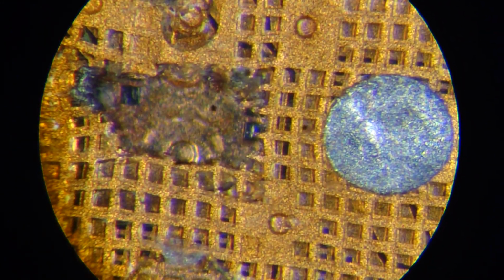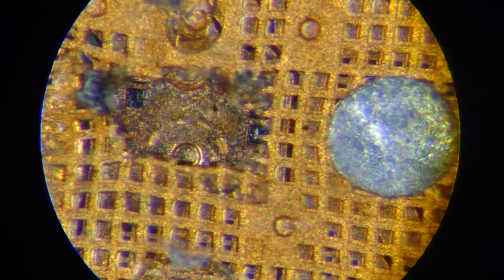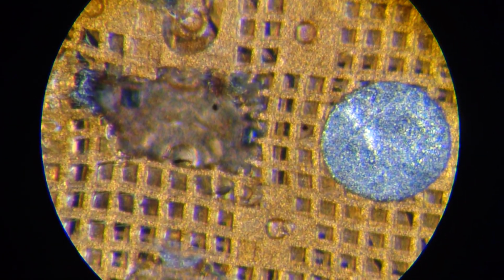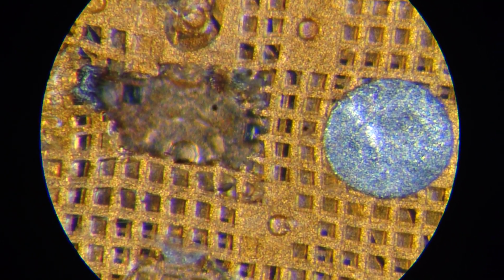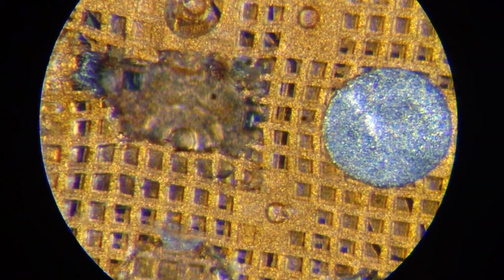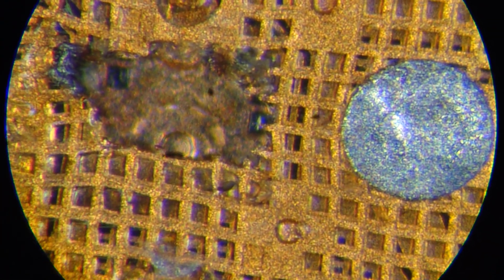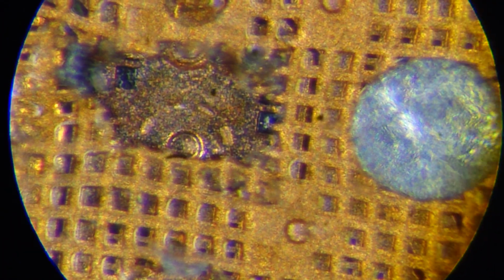And all those parts, most of them were checked with a less powerful objective, so just take a look and pay attention. I am focusing on the upper layer now. Yes, do you see it? And I need to increase magnification a bit. Okay, I am focusing on the upper layer. Now I'm focusing on the lower layer.